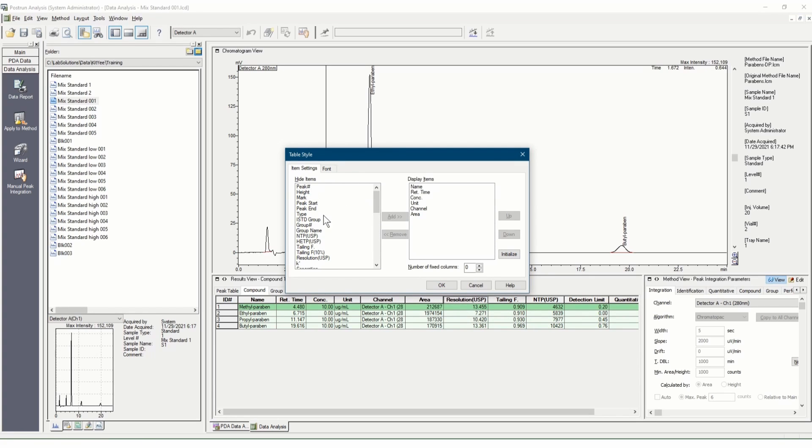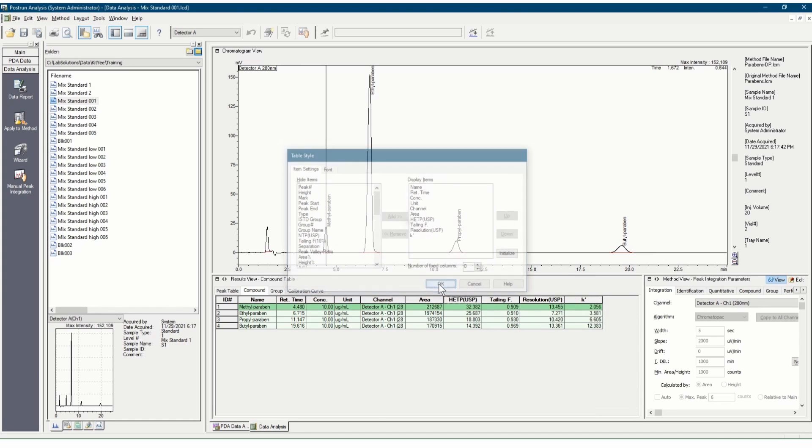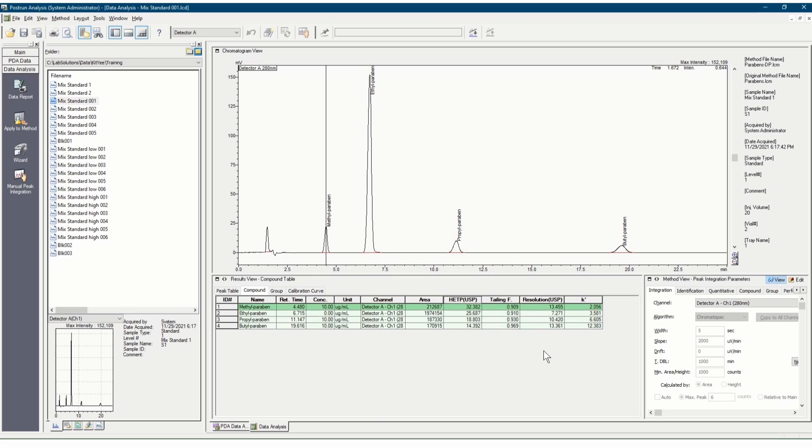Then, add parameters such as HETP, tailing factor, resolution, and K' to display items. Once you click OK, the values of these parameters will be displayed in the table.